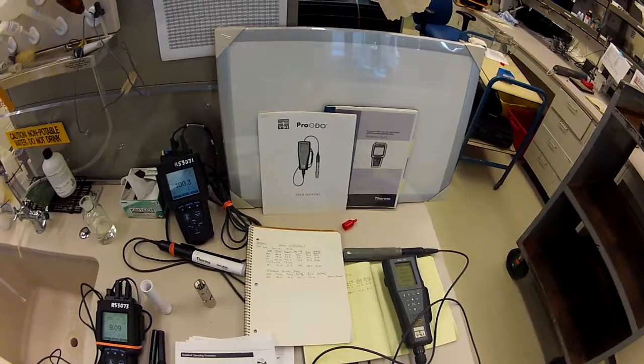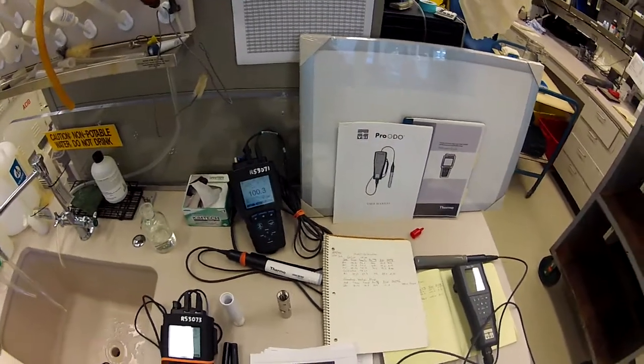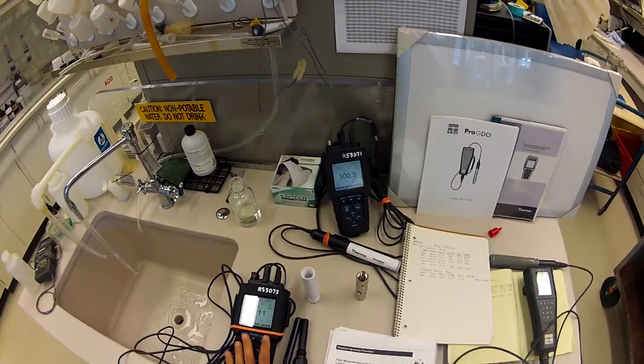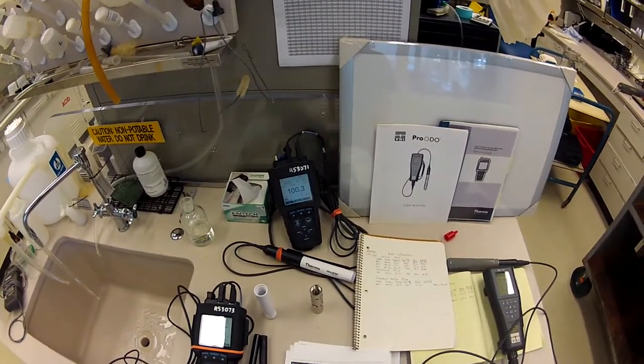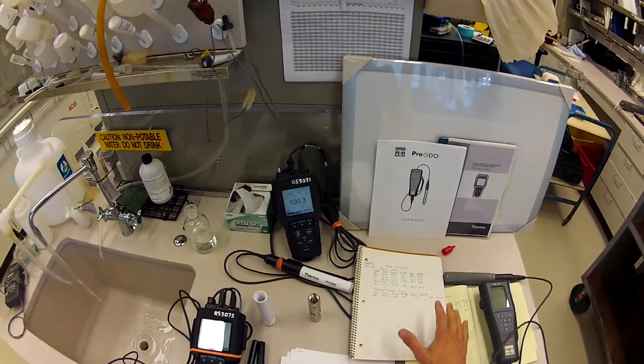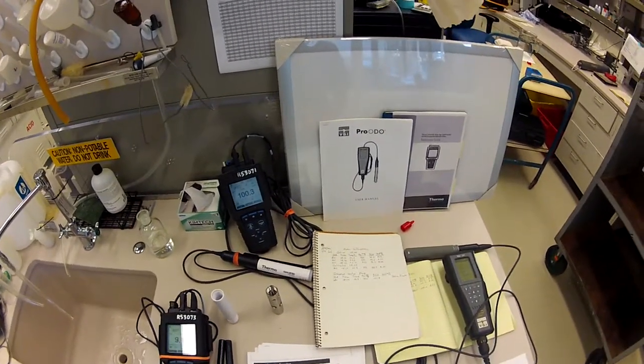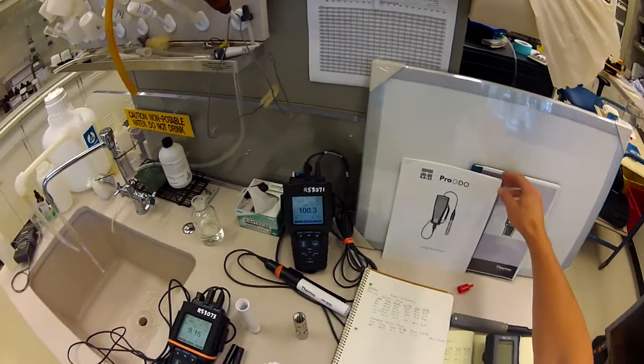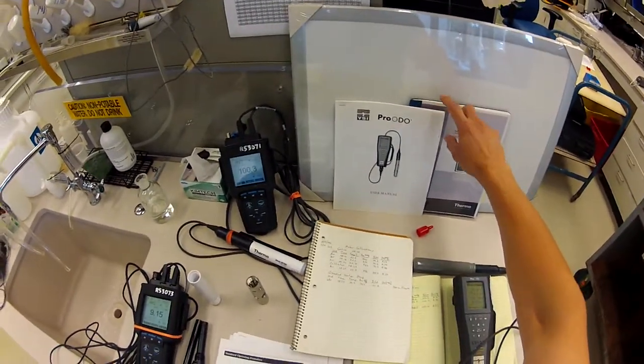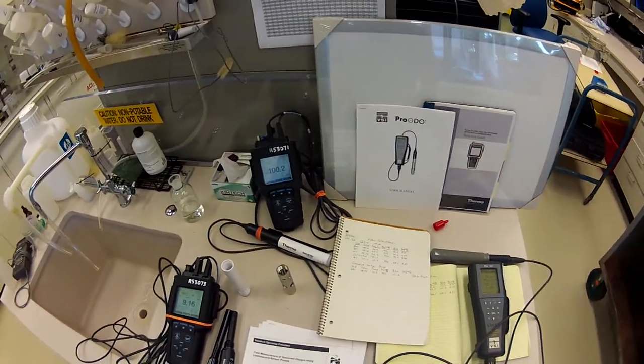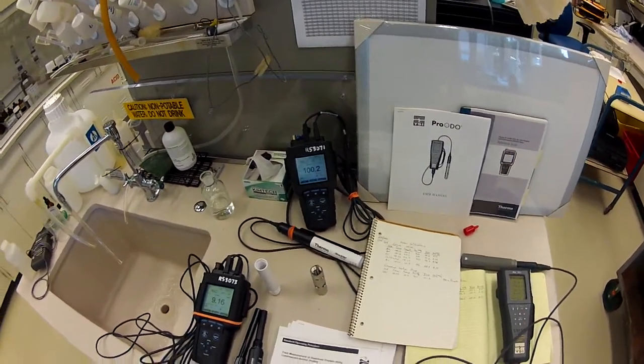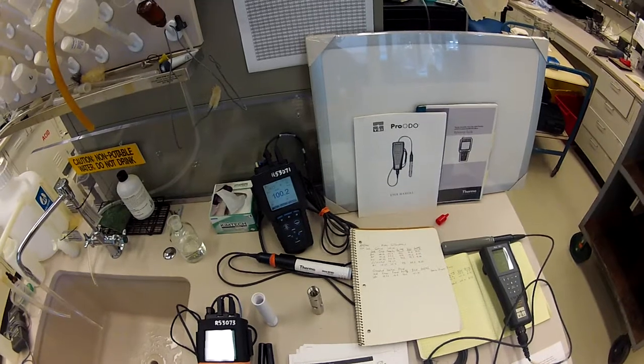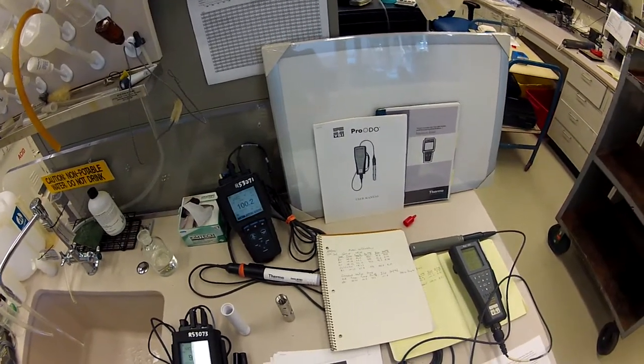So the equipment that we have in order to do this test - obviously you need to have a meter, you need some sort of logbook or field sheets, some sort of notebook for keeping track of the calibration that you do. The manuals will provide important information that you want to keep in hand, and you'll need some sort of chamber that we're going to fill with our standard.